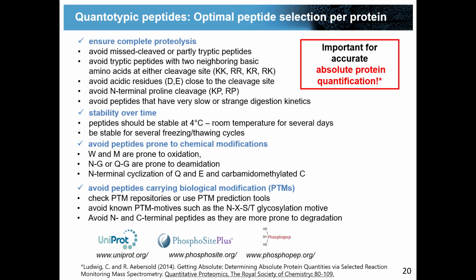So if you plan to do absolute quantification, these rules become much more important for you compared to if you just do a relative quantification between a lot of samples, but you must make sure that these things are happening in a reproducible way to everything that you relatively compare. But it might make you feel a little bit better about relaxing on a lot of these rules.